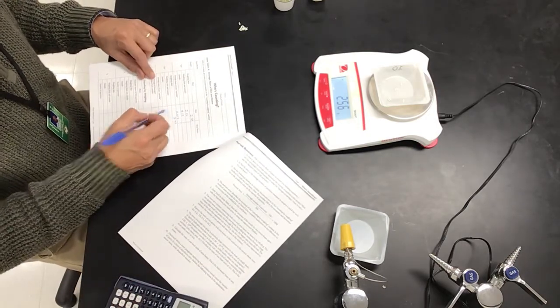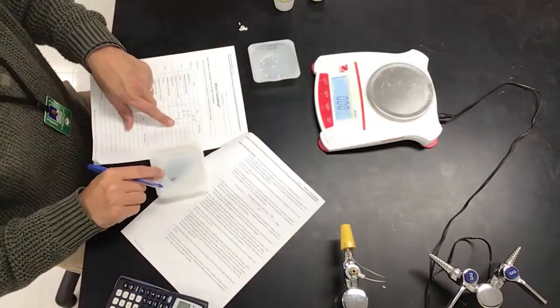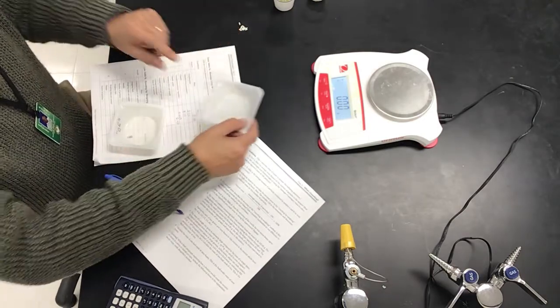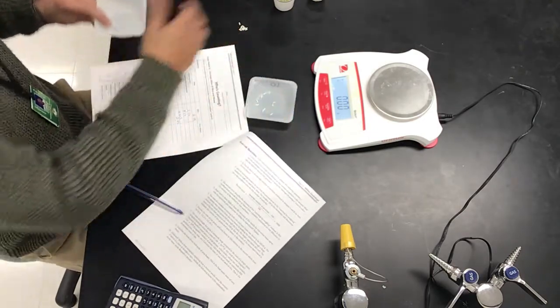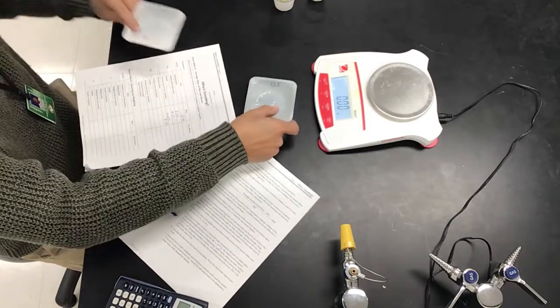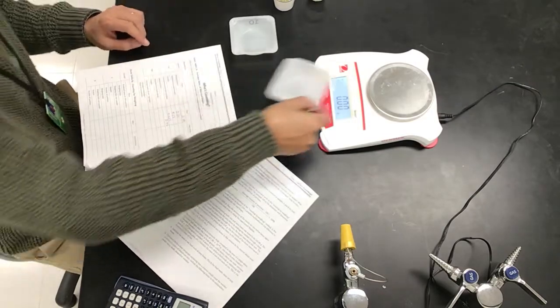Weighing dish and sample 2, for the 20, right? So I'm going to do it for 20. I already weighed the dish here as 2.44. Weighing dish and sample. Now I'm going to count out 20. There's 10 here already, and there's another 10 here that I already counted out. I'm going to add this one to it, so this will be 20 grains of rice. I put them on there.